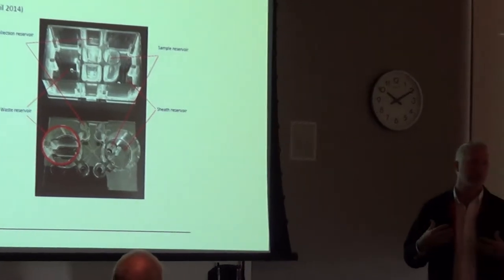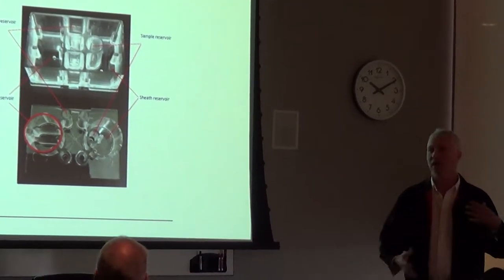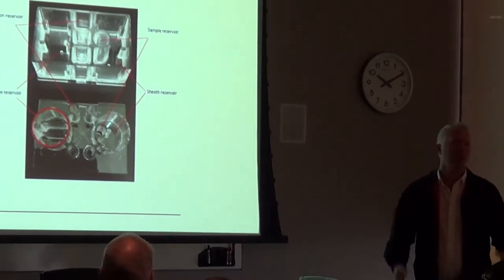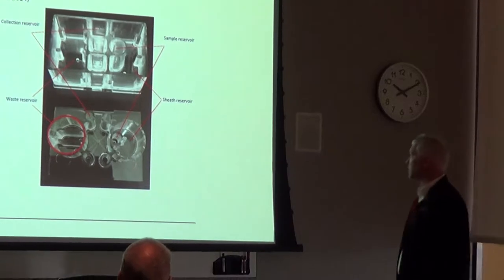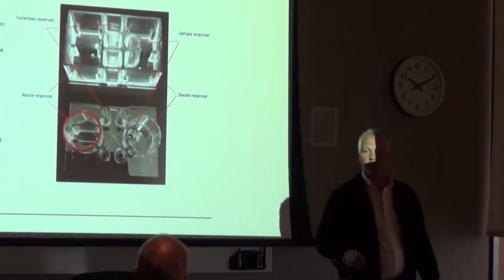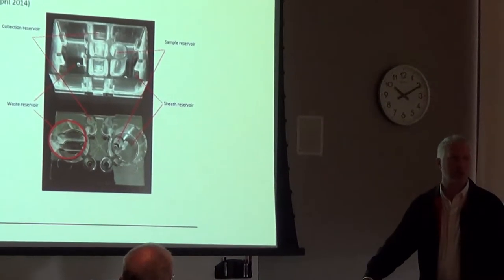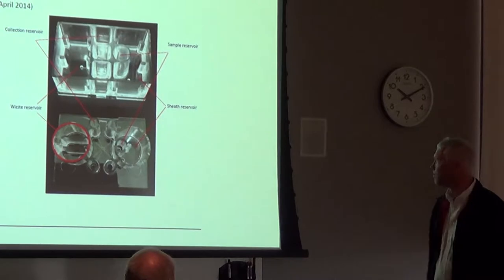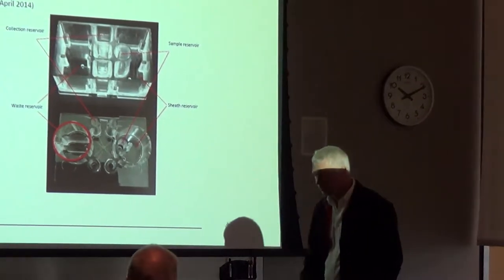So that gives us the ability to, if it took a couple of runs to get the job done, now if it's a bigger sample, we can handle it. This was 150 microliters, and now we're, I think, over 350 for the sample. So it's a big help if you need it. And again, if you come upstairs, we can show you all that.